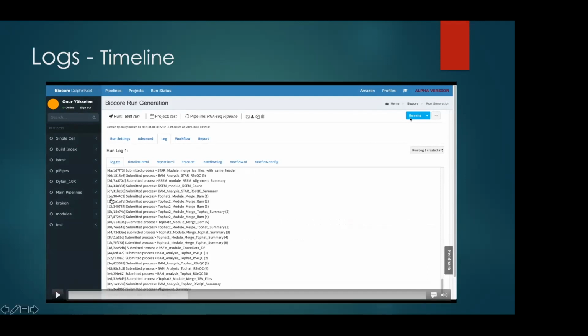So if you go and check the content of this directory, you will see what kind of a command is executed, what kind of input files were available in that folder, and what output files created after the job is completed. You can check those things inside the cluster.